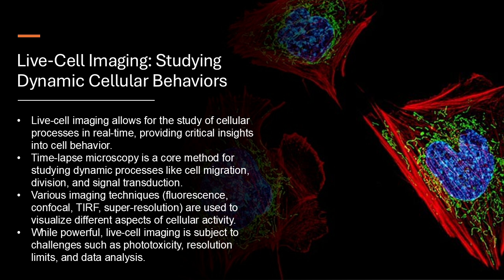So how is live cell imaging helping us understand this microscopic battleground? Well, imagine this. We can actually observe immune cells recognizing pathogens, activating each other, and mounting a coordinated defense to neutralize the threats. So we're basically watching the immune system's battle plan in action. That's a great way to put it. It's like watching a well-choreographed military operation unfold in real time.